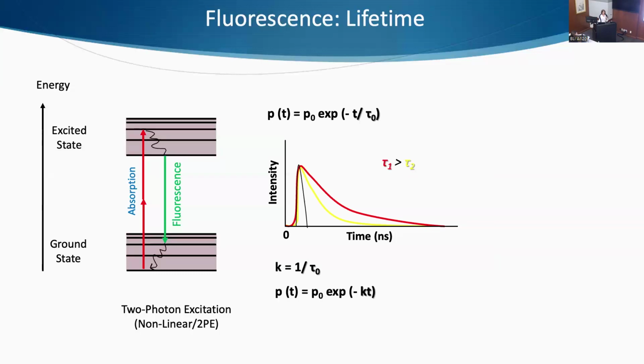And so this exponential decay occurs because we have these non-radiative processes that compete with fluorescence. So the decay rate is a summation of the radiative and the non-radiative decay. And then we can define a quantum efficiency. That's a measurement for how effective the fluorophore is.